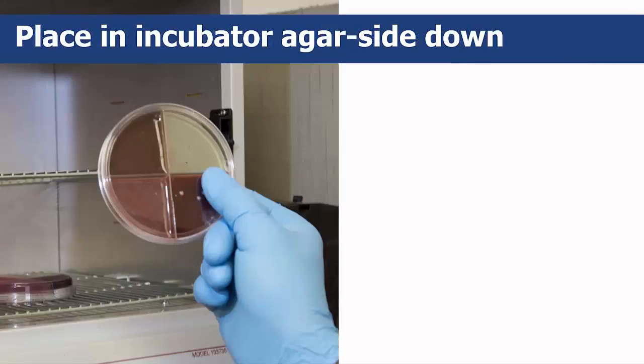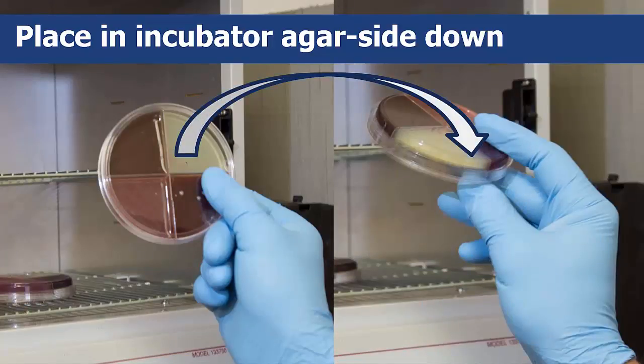After that, cover the plate and place it in the agar facing down in the incubator for 24 hours at 95 degrees Fahrenheit.